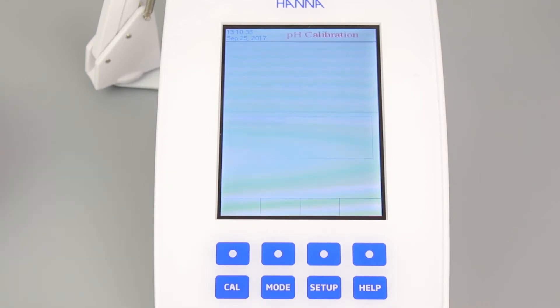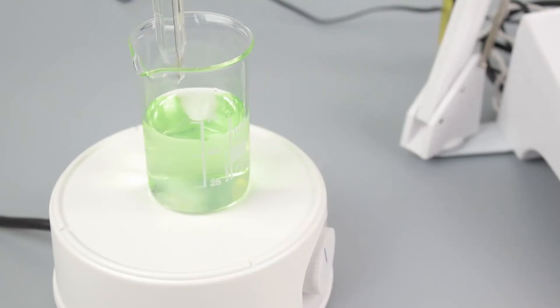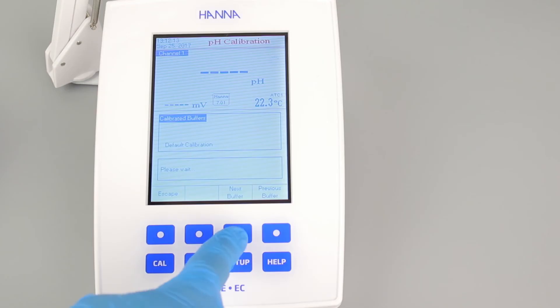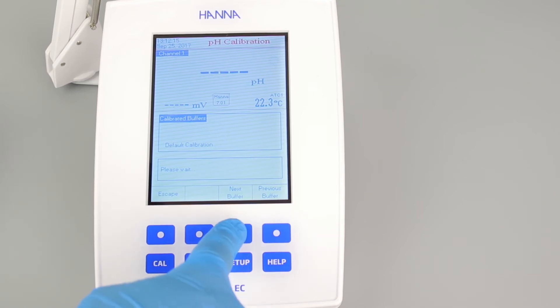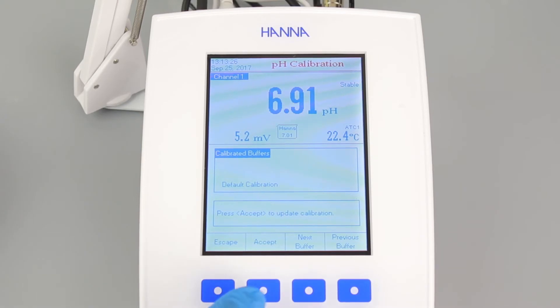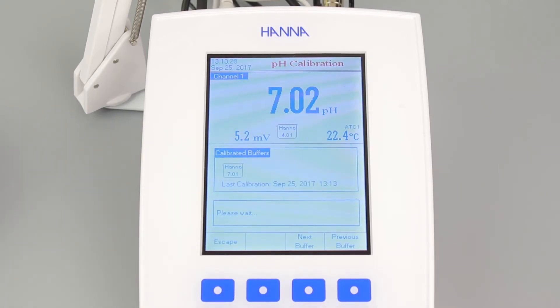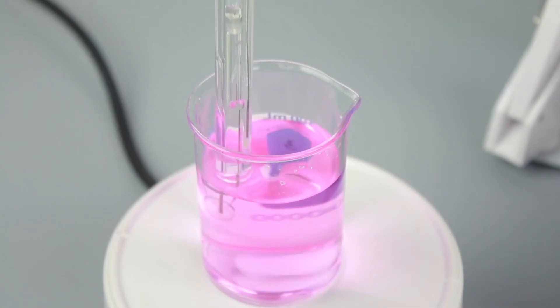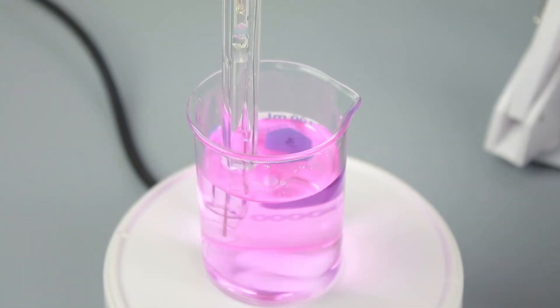Calibration is an important step to ensure your meter is operating at its best. We recommend calibrating before each use. We'll start with pH calibration. To calibrate your meter, press the CAL button. Then place the pH electrode into your buffer. Make sure the sample is stirring. Use the next buffer and previous buffer buttons to match the value you're using. Once stable, press accept and the calibration will be saved. Your meter can calibrate up to five points. Place the electrode in your next buffer or hit ESC when you have finished calibrations.